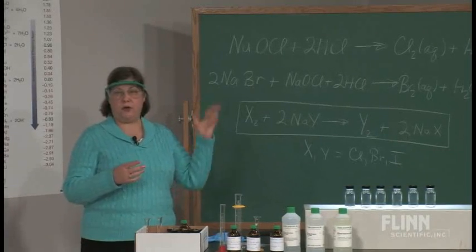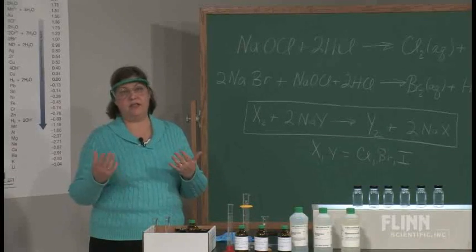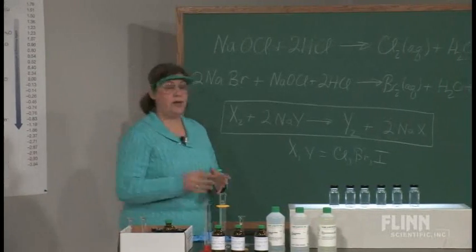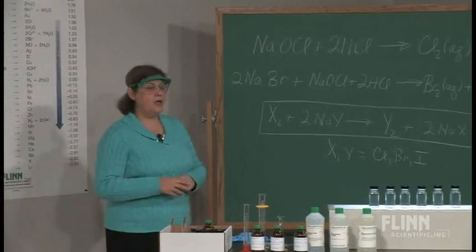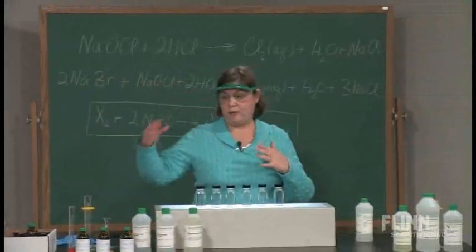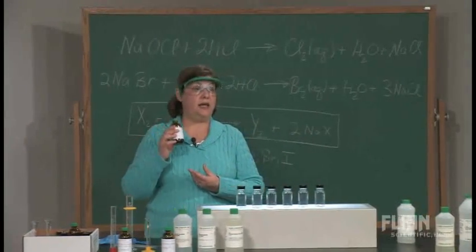Now, iodine, you don't have to do this. You can take iodine, which is safe to store, and you add a little bit of sodium iodide because it doesn't dissolve just without any added sodium iodide. So that's how you would prepare the solutions. And I'm not going to do that. We've already done it.